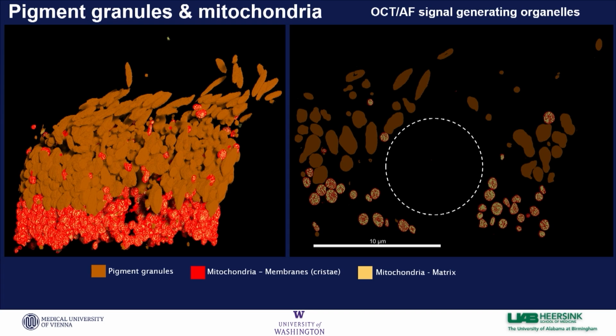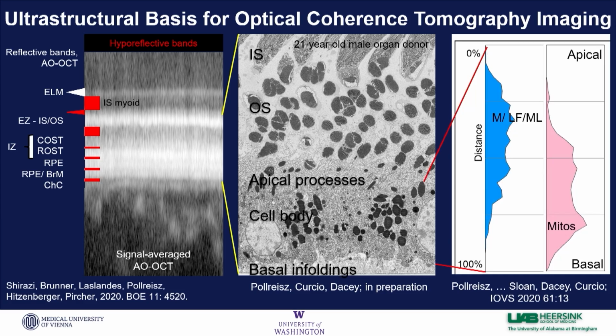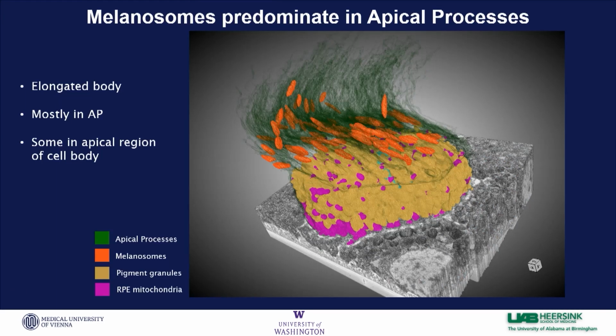Unfortunately, we have quite high anisotropy, so getting it to display nicely in 3D in meshes is not always the best. This is still an old slide, disregard that.